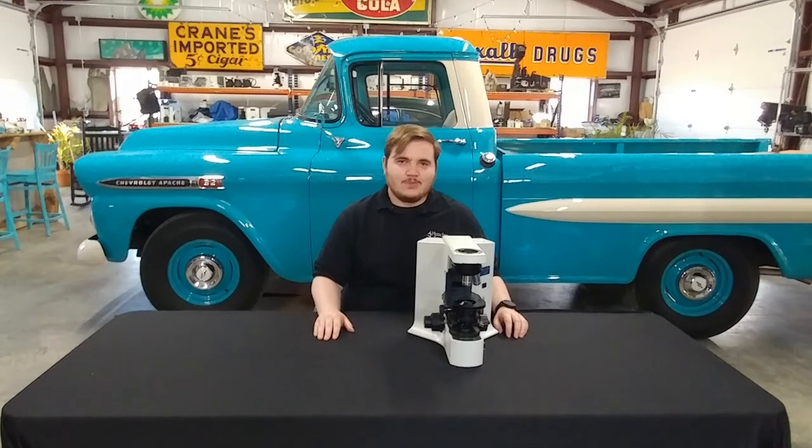And that was how to replace the bulb on a BX41 microscope. Thank you all for watching, and have a nice day.